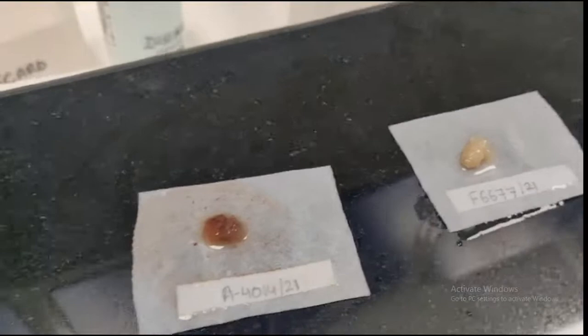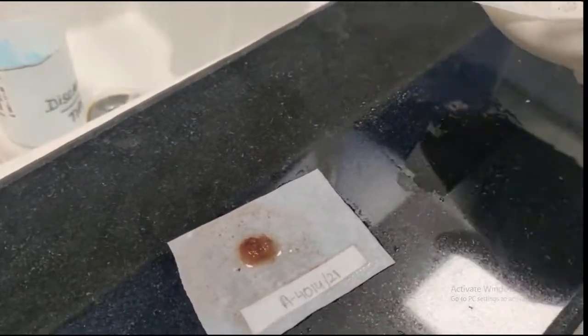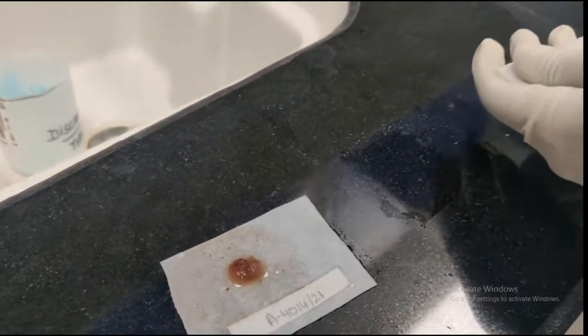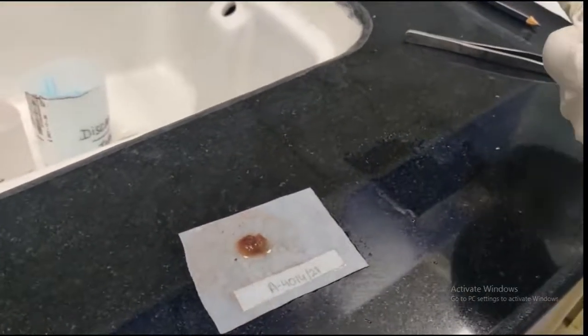Now these will be folded and will be processed as small tissue biopsies. These will be packed into the plastic tissue cassettes and will directly go for tissue processing.